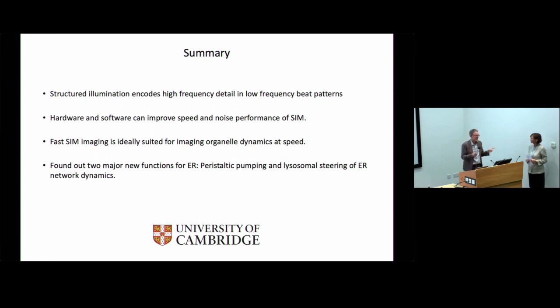So we can definitely correlate. We've done some modeling about this. Not me personally. David Holcman in Paris has done modeling on our data, and he sees definitely this mixing improves the speed at which the solutes can go through the ER. But we don't have the full story yet.